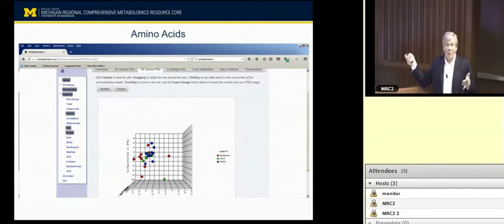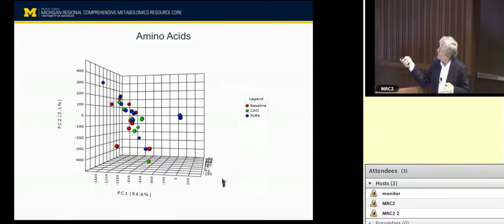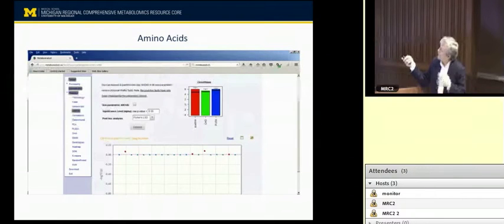Now, if you remember, what we did in this diet was we fed them a standard protein diet, keeping protein constant in this study. And so maybe it would make sense. This is just looking at the plot a little bit differently. If you look at the absolute values, you can see there's not much change in the individuals before and after, and so your bar graph is not that much different. This is MetaboAnalyst.